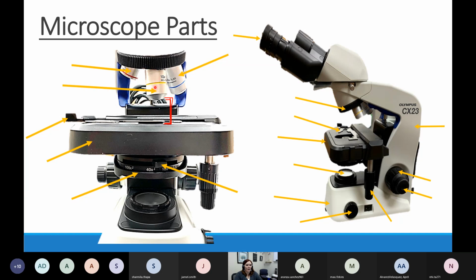And if I get it all the way in focus on yellow, then I should have to do just a little bit of tweaking to get it in focus on blue. So parfocal microscopes mean do it right at the beginning on red. That'll help you with yellow. And if you get it right on yellow, that'll help you with blue.